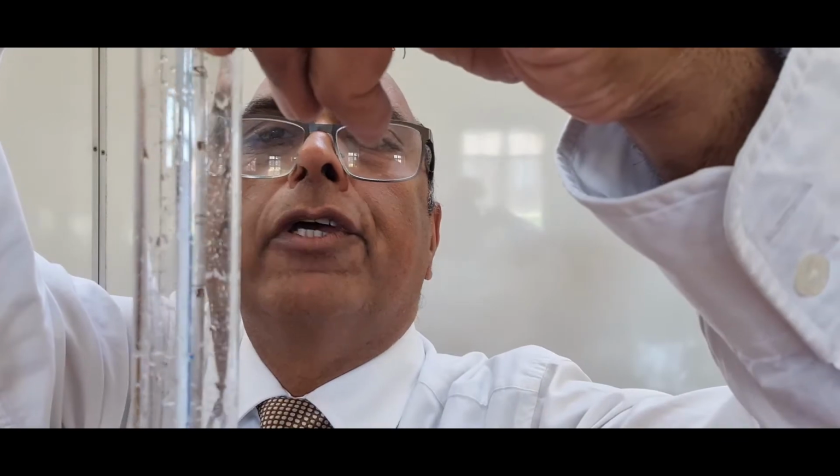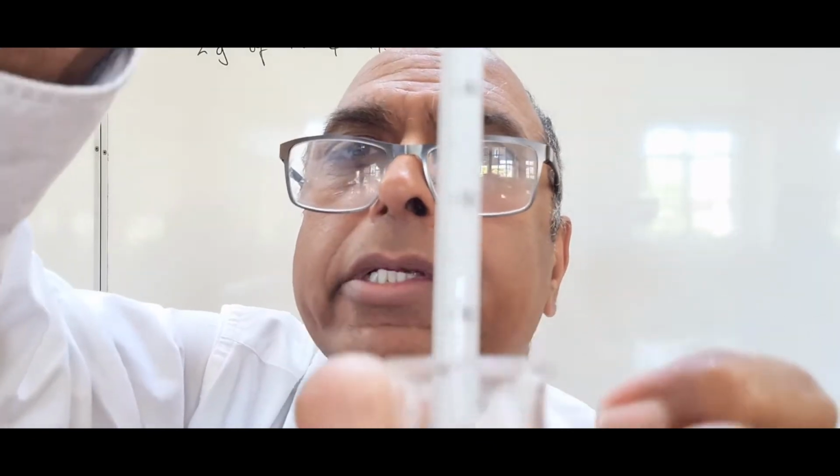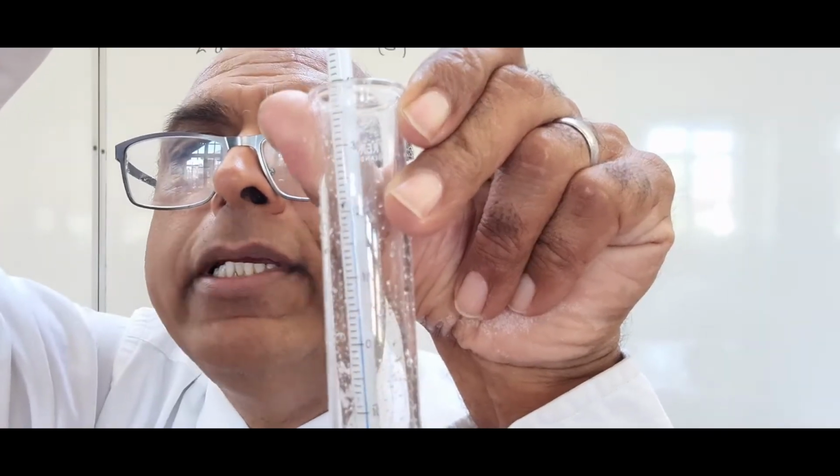Right, now there we go. Can you see? The crystals are starting to form, and the temperature is 24 degrees. Actually, the temperature has now gone down to 23 degrees, 22 degrees. I think that cold tap did the trick. About 20 degrees. But we need a temperature to do the calculation.